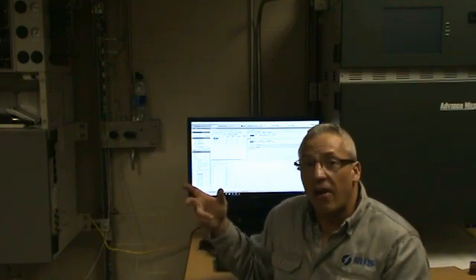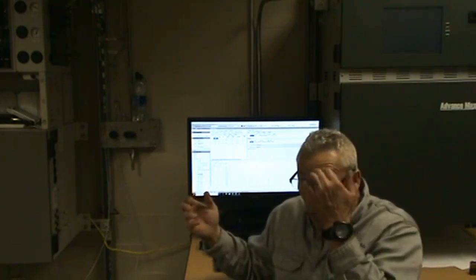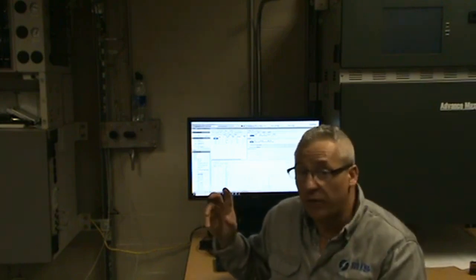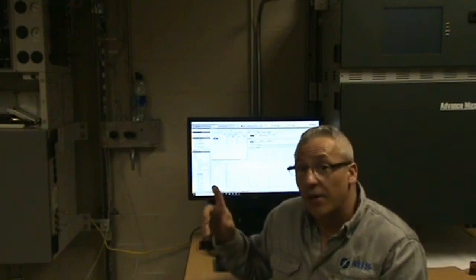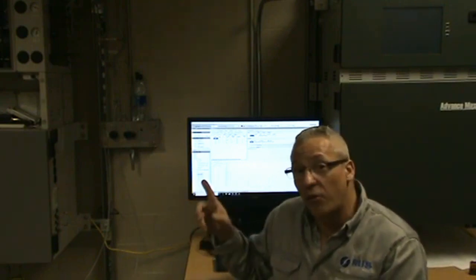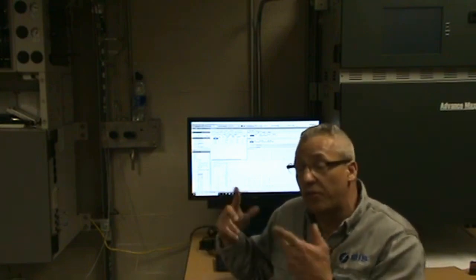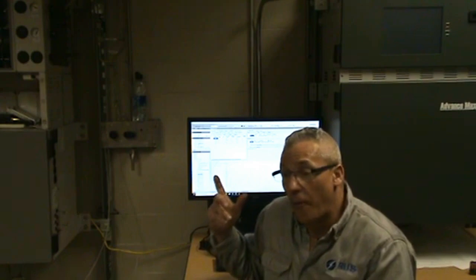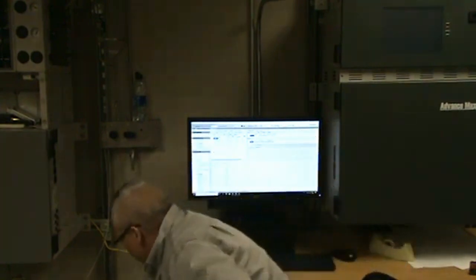model 50. Carrier coming in on 3 and 6. We'll sweep the sample loop. That's going from 2 to 10. Sample coming in on 1, out on 10, or 2 to 9 is sample loop. In on 1, out on 10, so 2 to 9 is the external sample loop. All right, so once we're bringing our samples, let's go ahead and get our bottle cranked on.